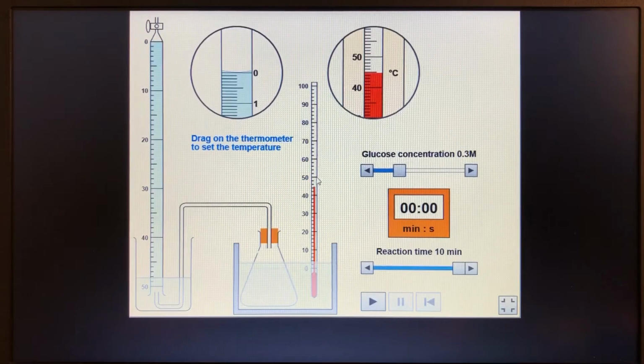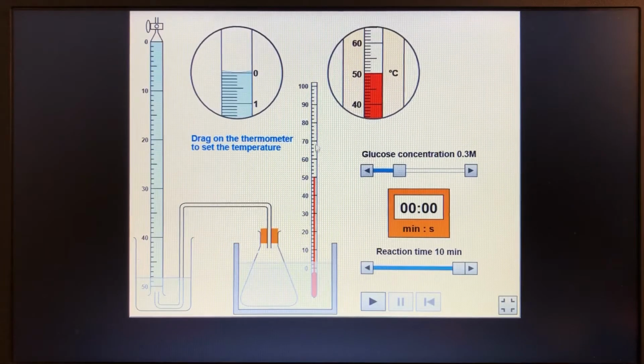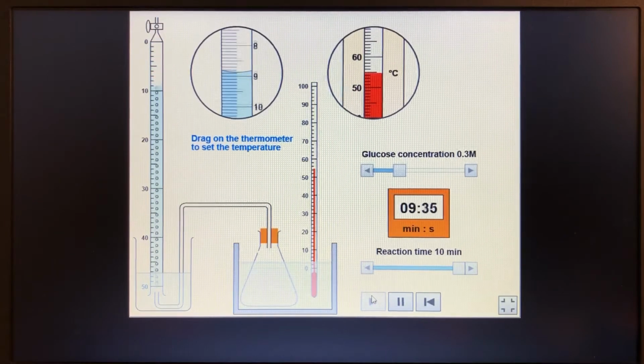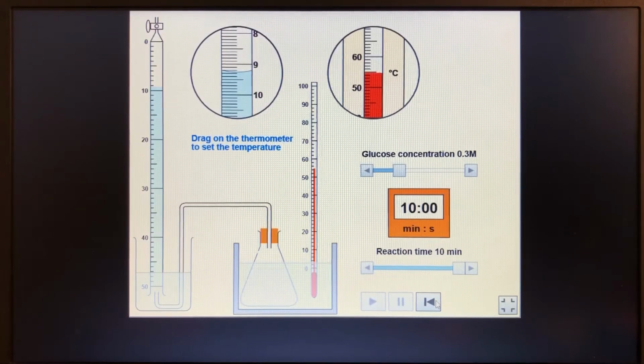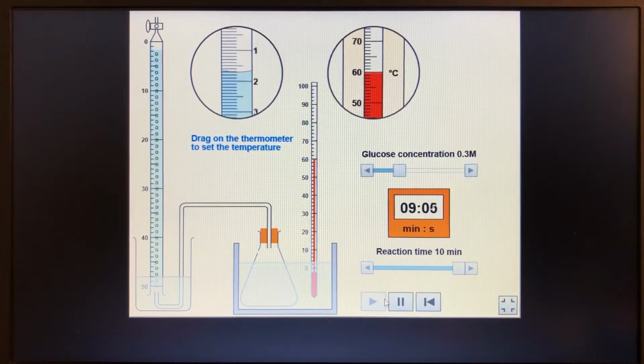Okay, let's jump up to 50 degrees C now. And we've got 22.4. Again, I'll keep going. I can't remember what I took that results table to. I should have looked more carefully, shouldn't I? 55 degrees C, and we've got 9.3. So definitely dropping now. And let's go to 60 degrees C, and we've got 1.9.